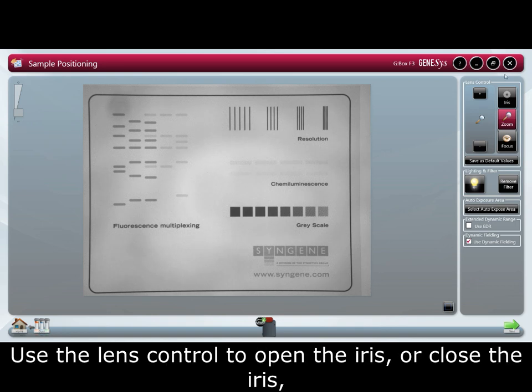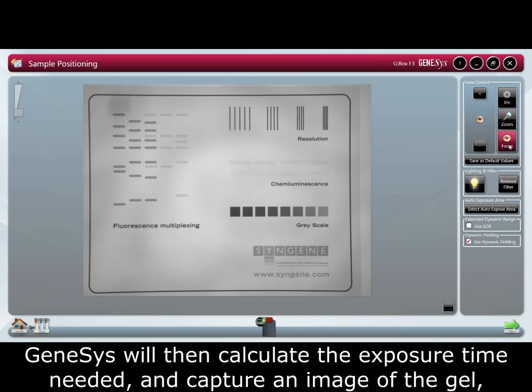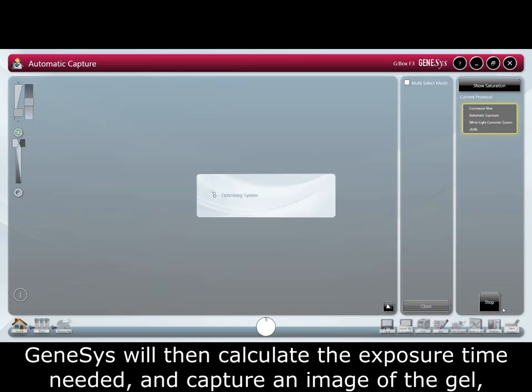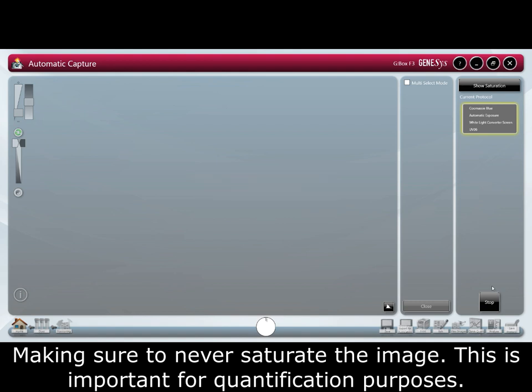Use the lens controls to open or close the iris, zoom in and zoom out, and to focus the image. Genesis will then calculate the exposure time needed and capture an image of the gel, making sure to never saturate the image. This is important for quantification purposes.